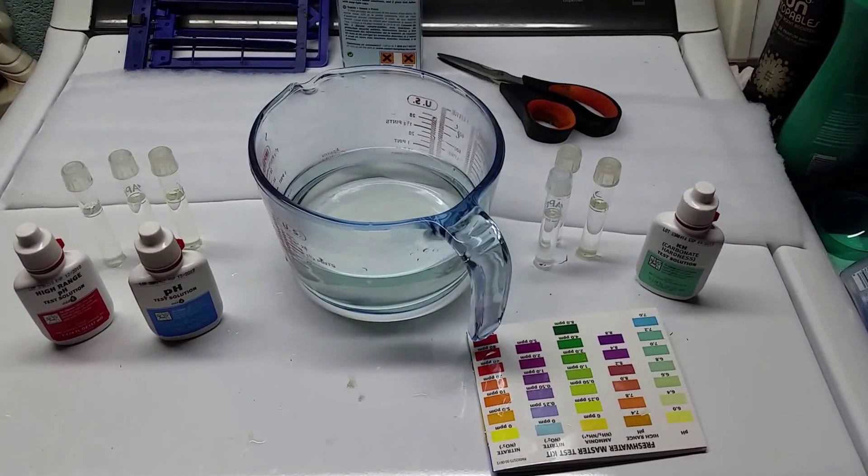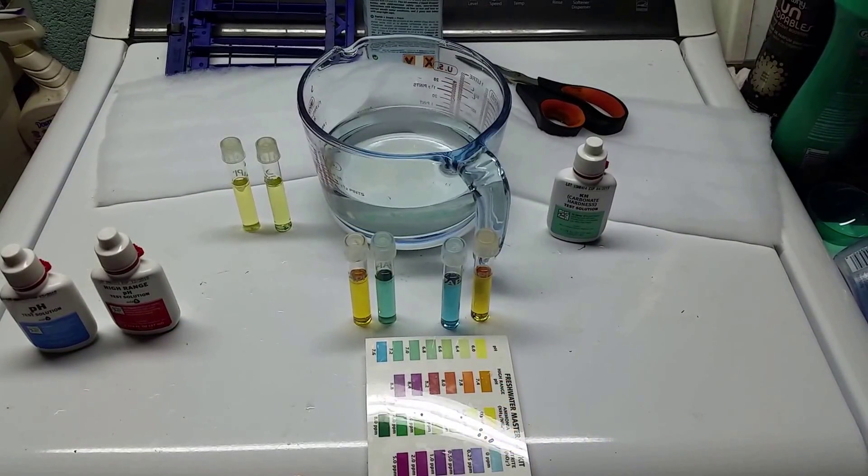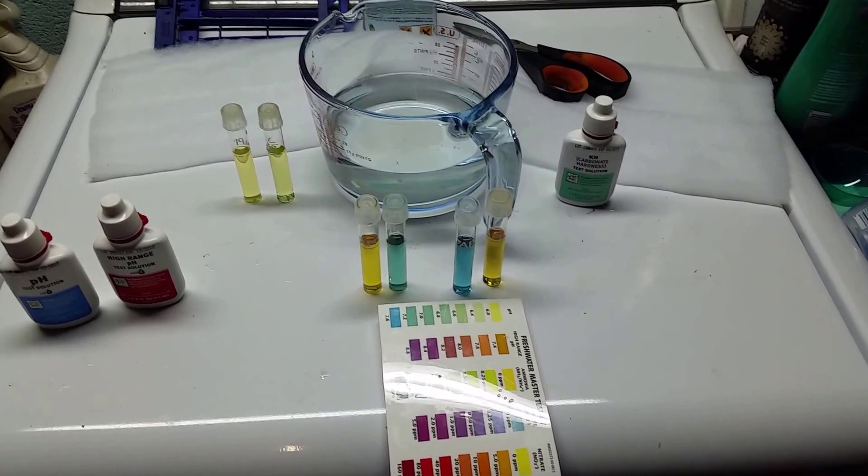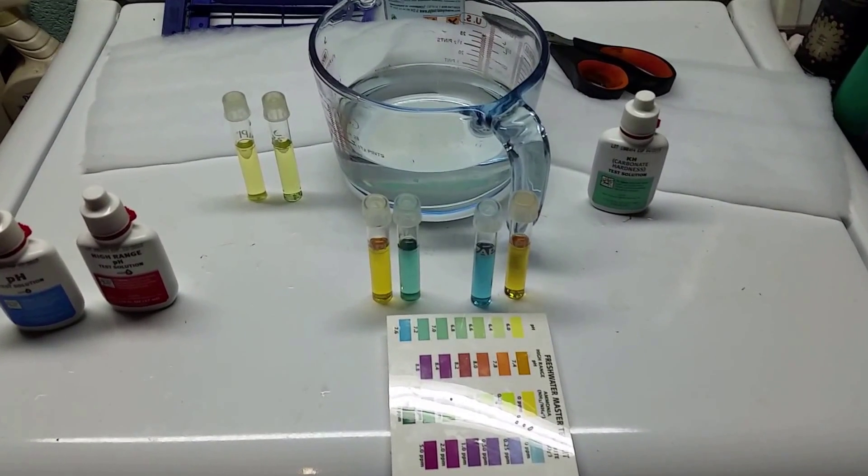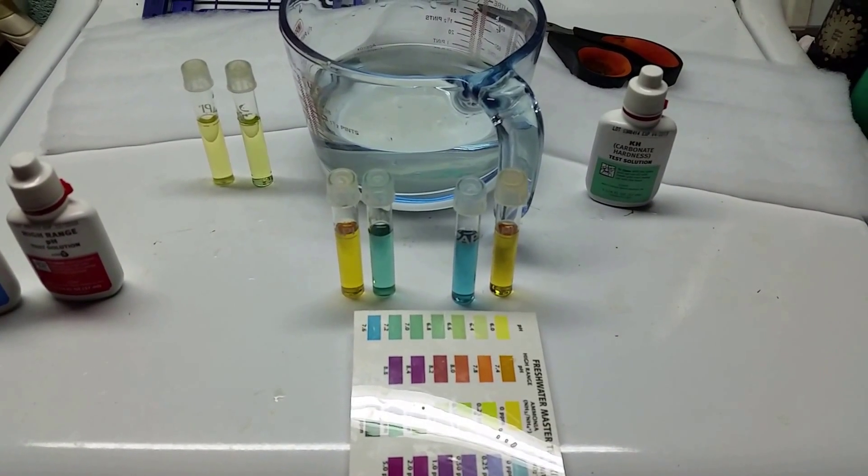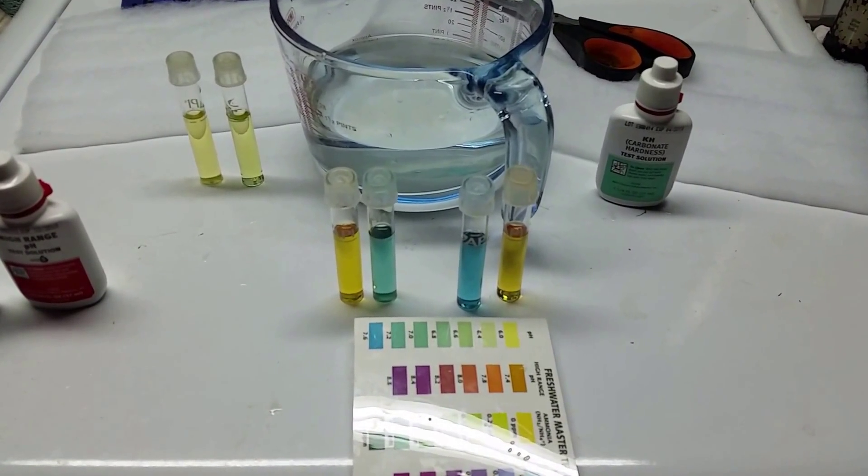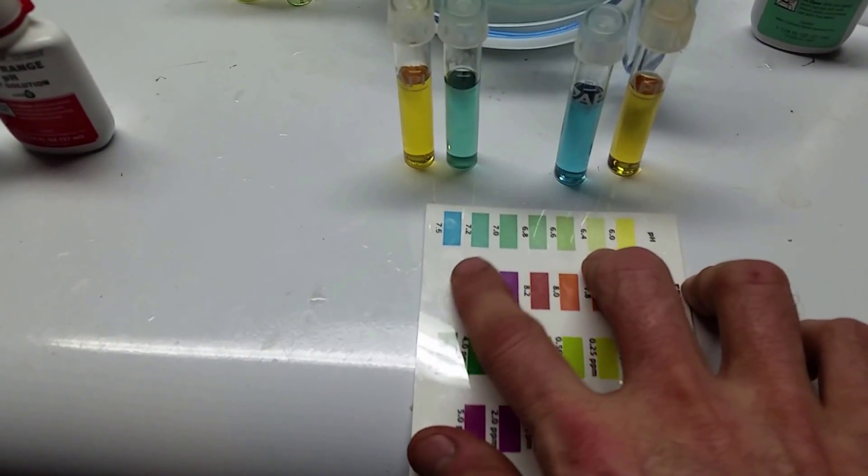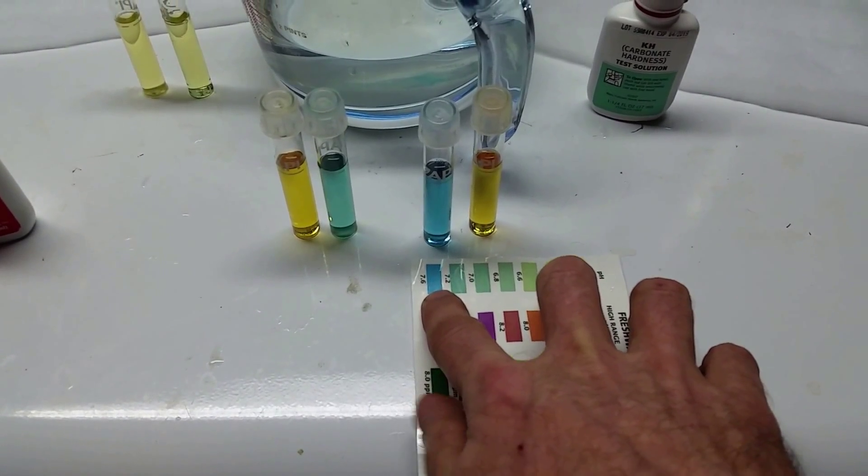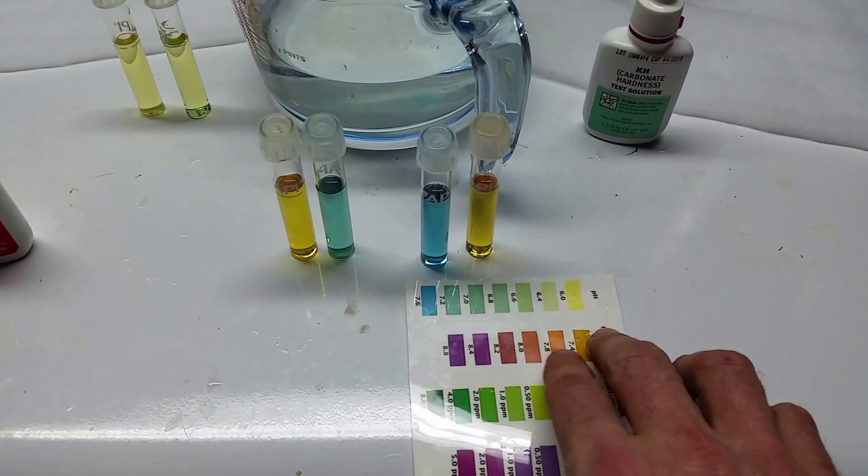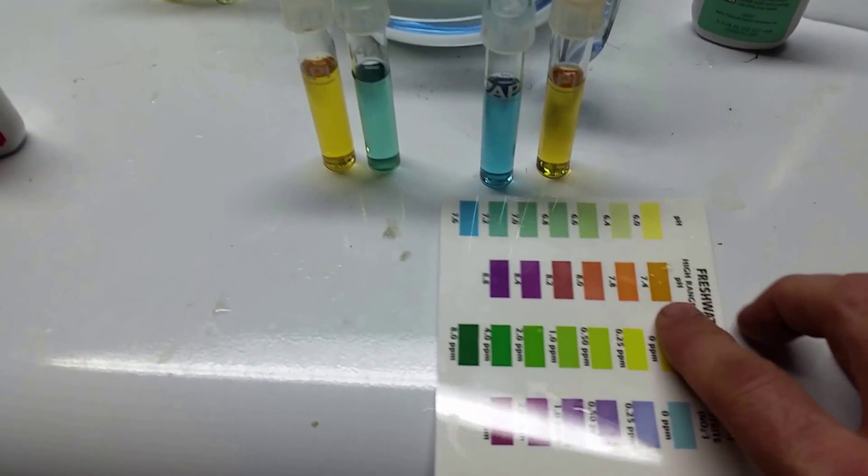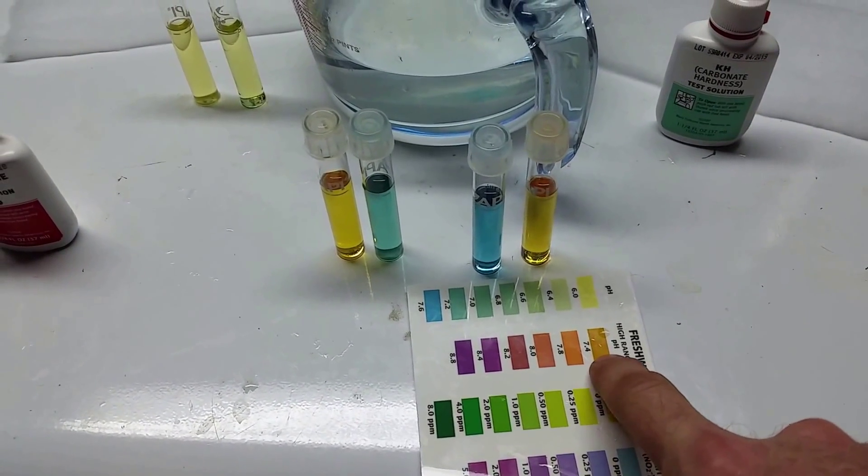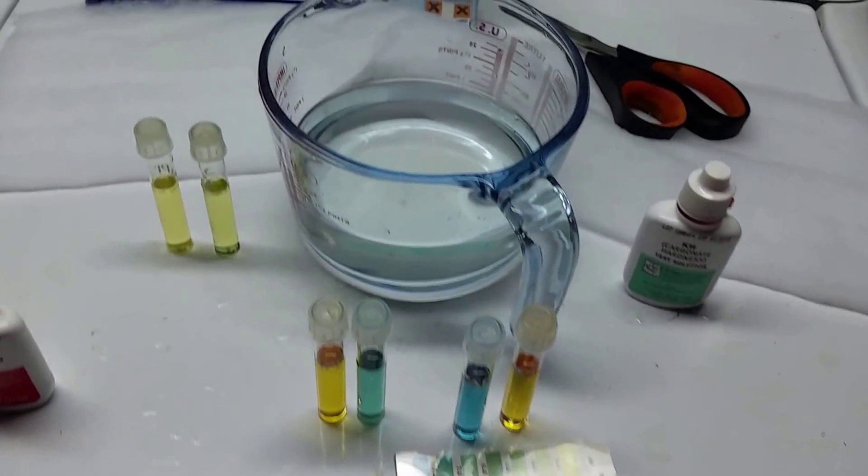All right everybody, we got exactly the results I was expecting. I cannot be happier with what I am seeing right now. It is exactly what I predicted it would be. I know it's a little tough to tell on camera. If you look at this vial, this is the vial from the degassed water that sat upstairs overnight. You see the bright blue, just like I was saying, it is kind of off the top end of the low range scale. And then the high range scale, we're not quite there yet, it's still sort of a little too yellowy to make 7.4, so we're probably sitting right around 7.3 on the water that degassed overnight.